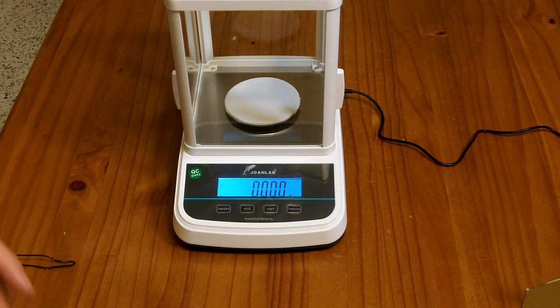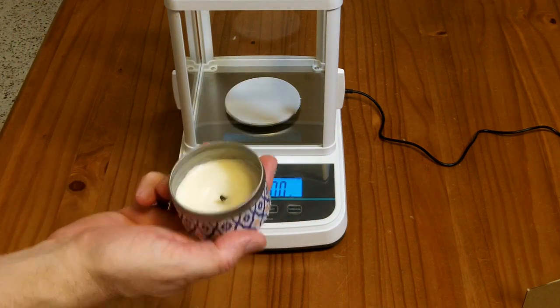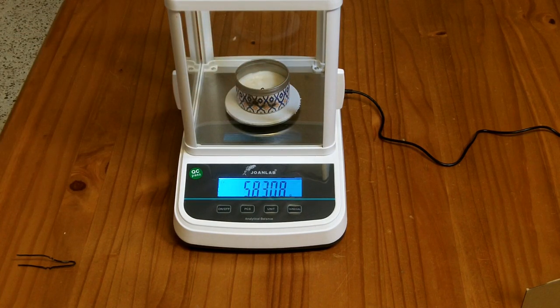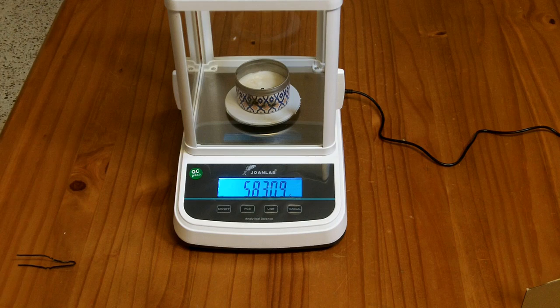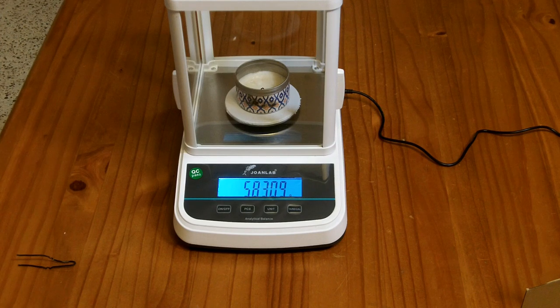So to demonstrate the accuracy of a thousandth of a gram balance, I have here a standard candle. We're going to place the candle in there. And it weighs, currently, 58.309 grams.